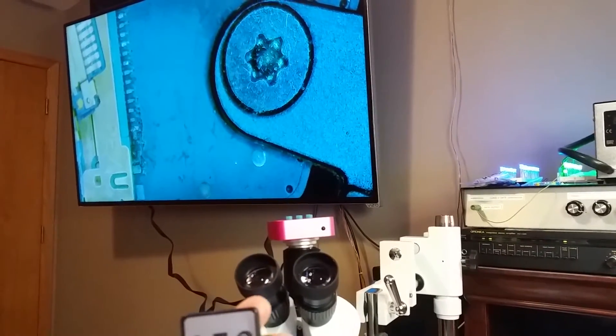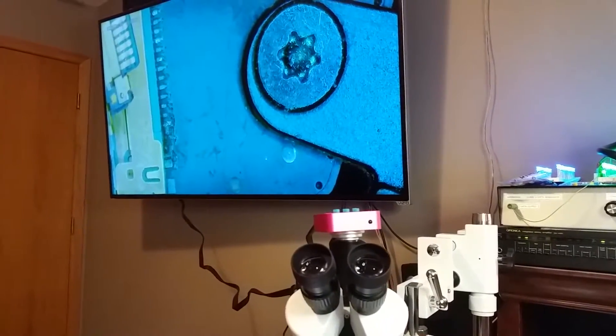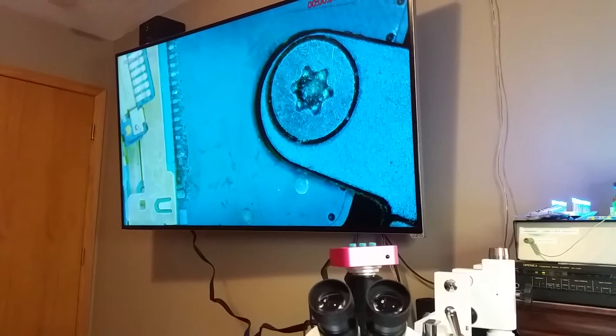I'm going to go ahead and record some video. Let's see if I can find the right button here. It looks like it's recording. I'm going to go ahead and save that to the SD card and play that at the end of the video.